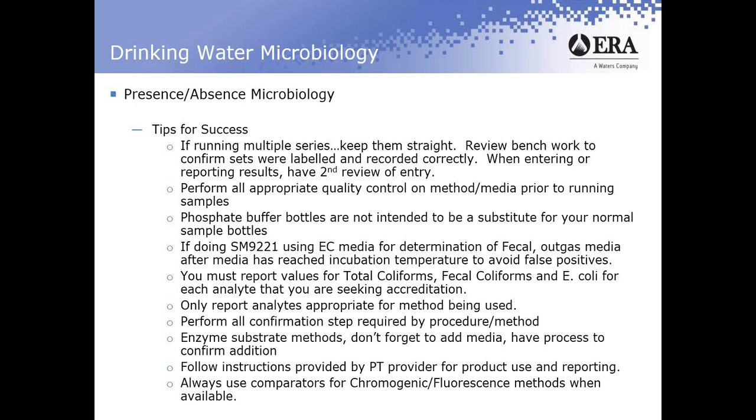Only report analytes appropriate for the method that you're using. If you're using a method that determines total and E. coli, you shouldn't be reporting a result for fecal. Should go without saying, but it frequently will happen. Folks just make an assumption, or they're not really well aware of what particular analytes their methods are determining.